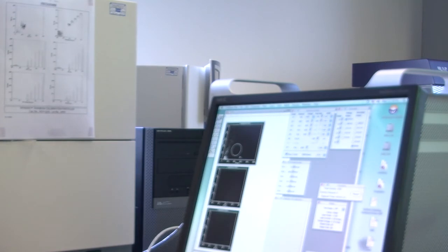Okay. Let's move that across there. So I've been running it so far on setup mode. Setup mode is where you don't save any of the data. So all the debris and the beads I've been running through so far, I haven't saved any of that. So now we need to actually run a sample. So this is an isotype match control.